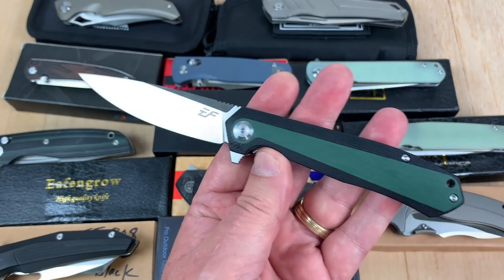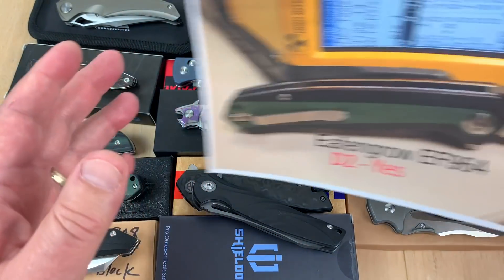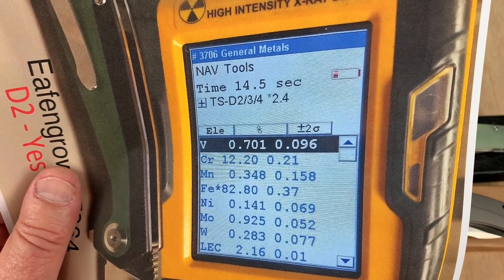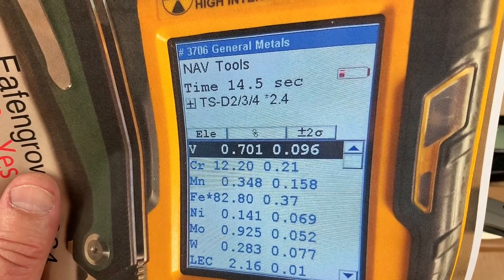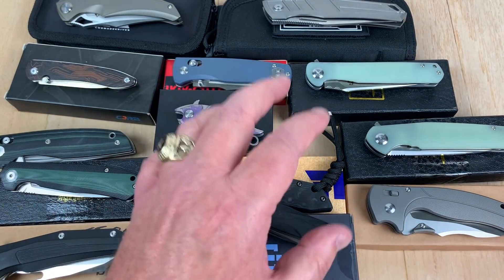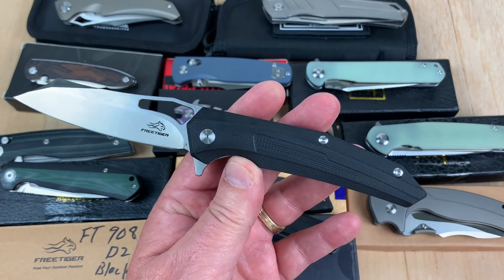I waited another three or four months and bought another group of Eafengrow knives. Long story short — on this EF964, yes, it's D2, it's real D2. The vanadium level is not bad — I've seen it as low as 0.3, but 0.7 is not bad. Chromium at 12%, so yeah it's typical D2 and that one is real. I'm gonna have more Eafengrow knives on batch 42, stay tuned.